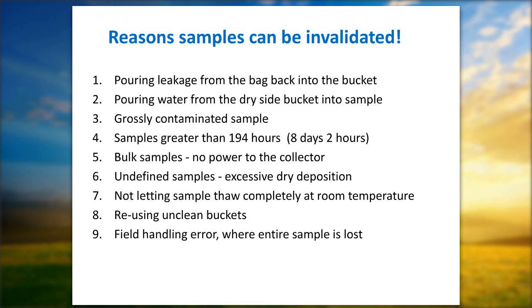Jeffrey already highlighted number 1. We've had samples lost in shipping, and we're trying to rebuild the record. We ask you to keep that pink copy for your records, ideally for at least a year. It happens maybe once a week. We'll ask a site to fax us the copy in, especially with the upcoming holidays. Tracking information isn't 100% reliable. You may see that it's received at the lab, but we get 300 samples at once. We sign for one thing. We don't check them one by one. Samples float around with UPS for a while, especially around the holidays.